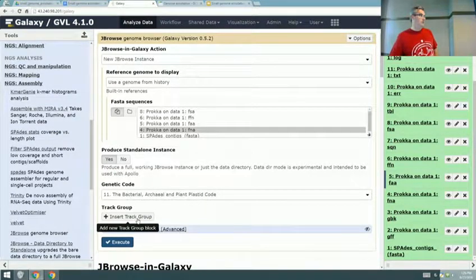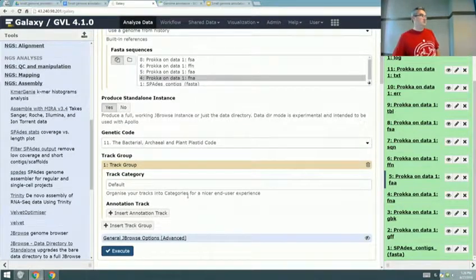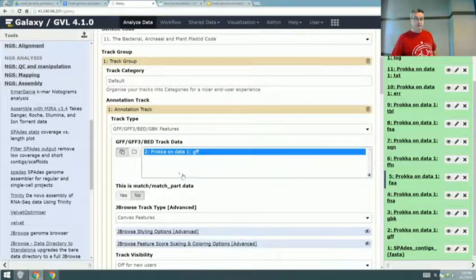Oh, yeah, I'm on the one with the IP address. Actually, it is in the other history, on that server. Gotcha. But are you in the small genome annotation history? The GFF is in the small genome assembly. Yeah, it looks like that.